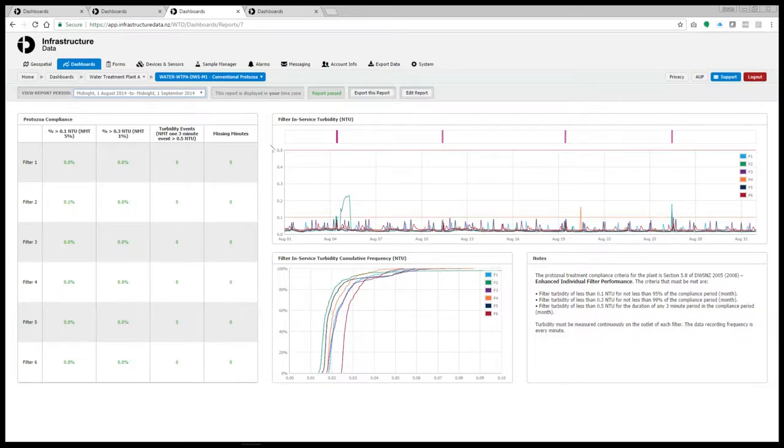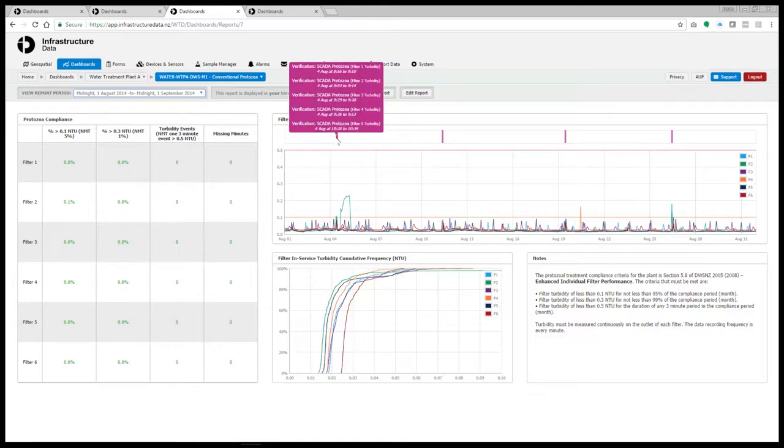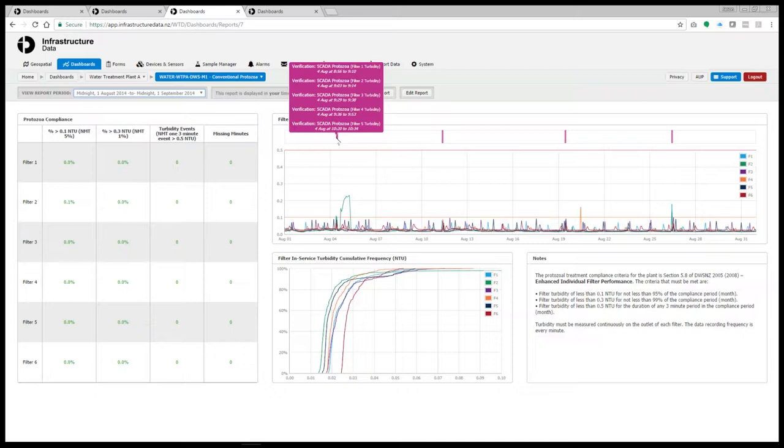Also on the report we have a time series representation of the turbidity data and cumulative frequency data and some explanatory notes. On our time series data we show a ticker tape which has our maintenance activities. So verifications and calibrations for the turbidity meters. Again a great way to demonstrate to your drinking water assessor that you are maintaining your instruments.